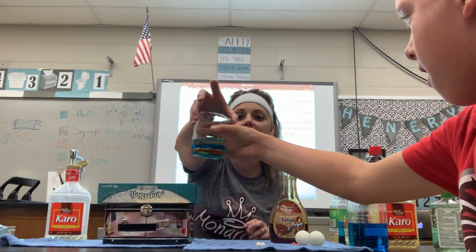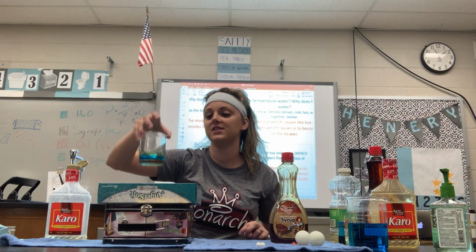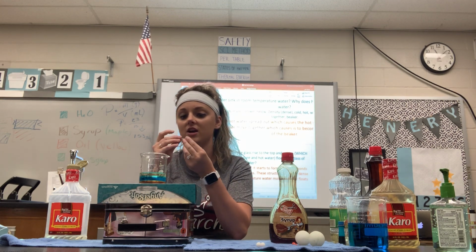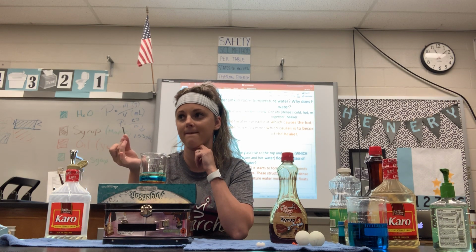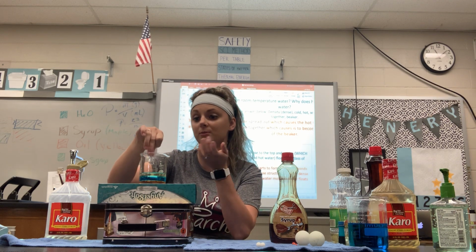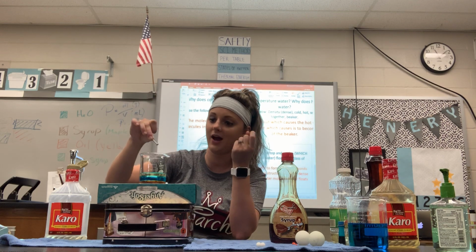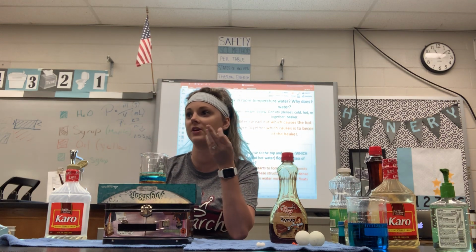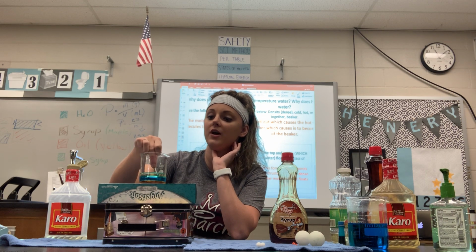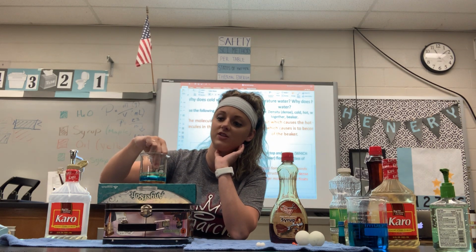Okay, so now what I'm going to do is actually put some solids in there. We're going to see if they're more dense or less dense and of which layers. First thing I'm going to do is just a regular nail. So again, I'm going to bring it to the plane of the oil, because if I throw it down there, it's going to get to the bottom regardless because I'm putting too much force into it. Usually you could even flatten it, if I had tweezers I'd flatten it out so it was going in more horizontally.